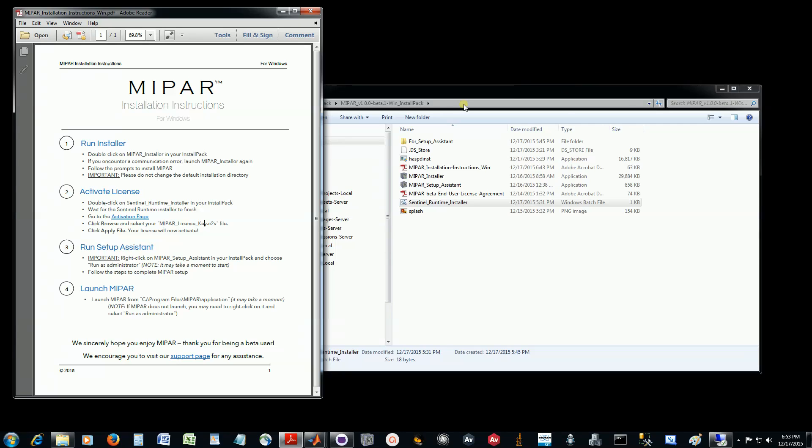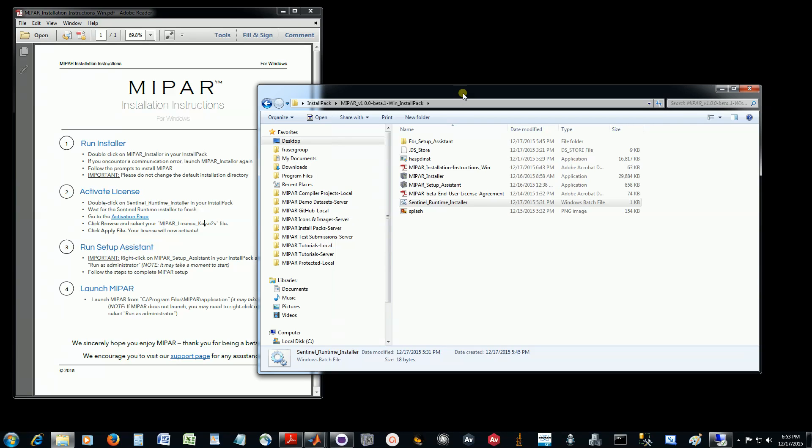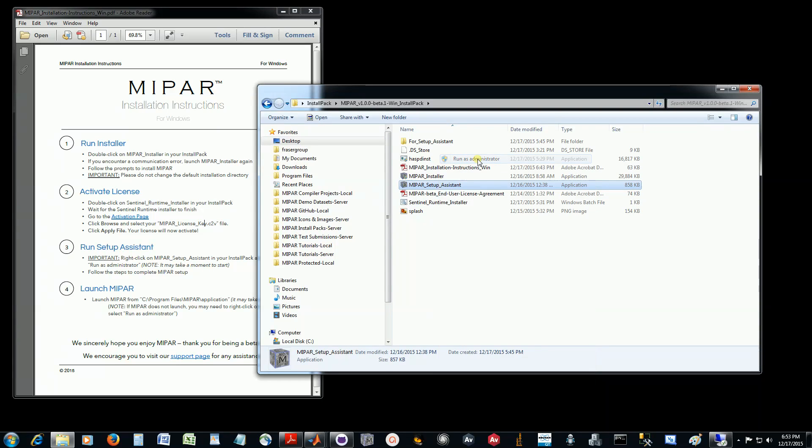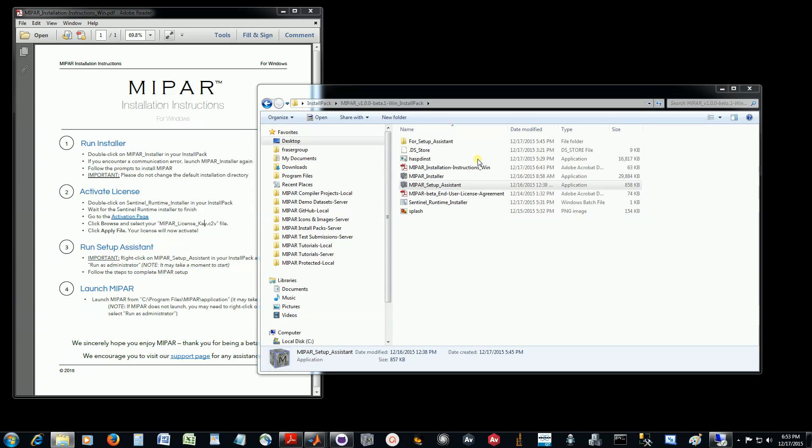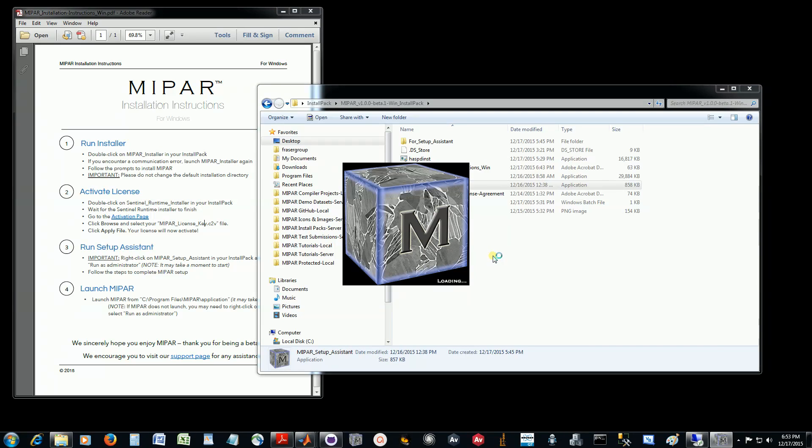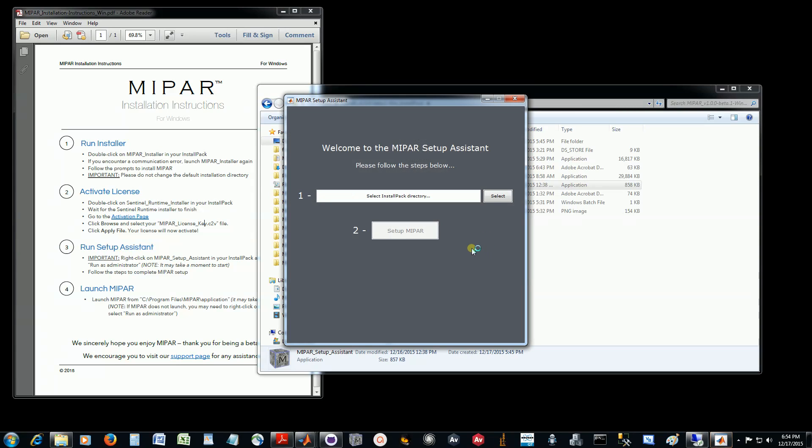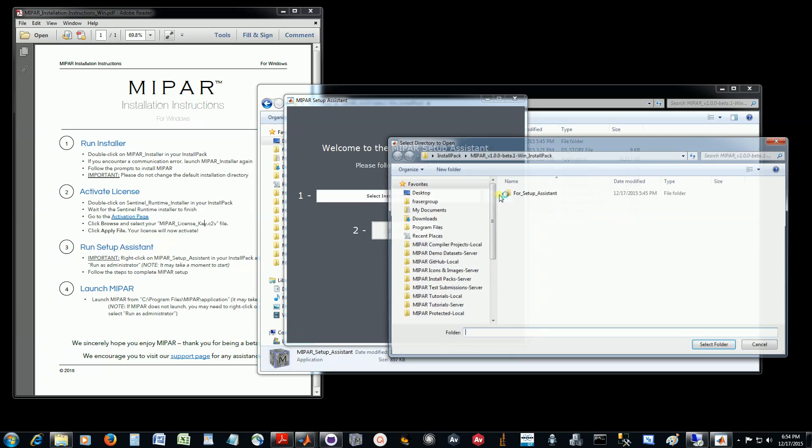We can close this, and the final step is to run the Setup Assistant. On a PC, you need to right-click on the Setup Assistant and choose Run as Administrator. You may be able to double-click on it, but to be safe, run as administrator. We'll just let the Setup Assistant start; this may take a little while. There are only two steps in the Setup Assistant. The first is to select the location of your install pack, so we'll click Select.